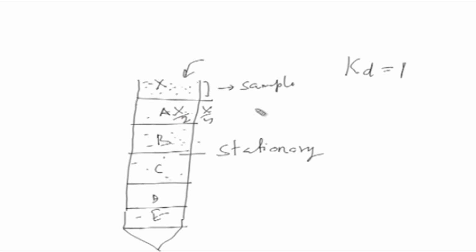Now let's go back to the discussion and understand this whole thing. That is the whole concept of how the separation is happening in column chromatography. All right. So when you are doing this separation, it could be depicted by considering a column packed with a solid granular stationary phase, as I have shown you, and it has a particular height, which could be anything.